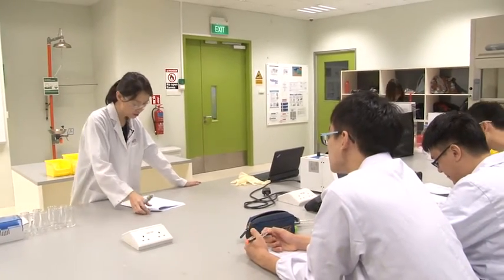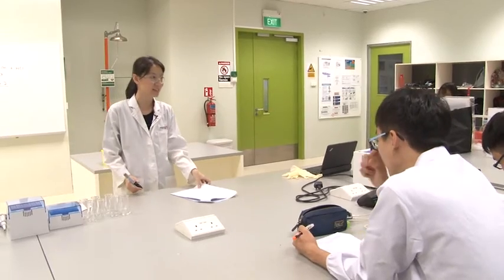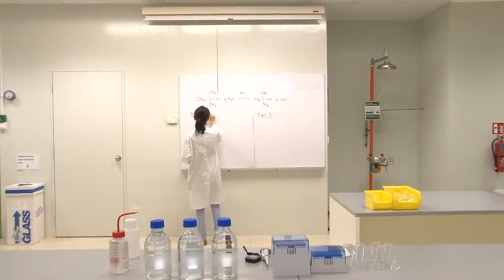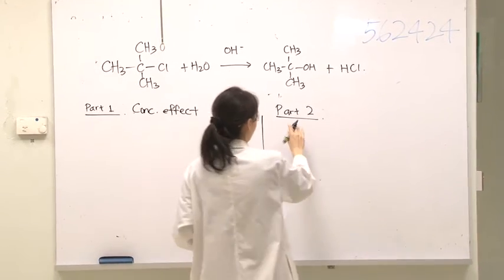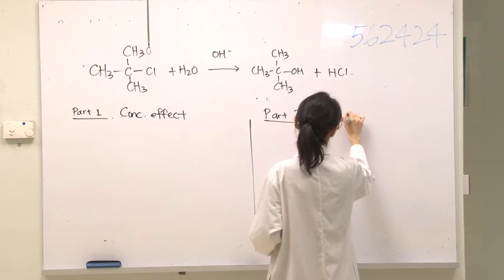So today we're going to investigate two things about how we perform SN1 kinetic studies. Part one is going to be concentration effect. So we're going to investigate the concentration effect of SN1 mechanism. Part 2 is on solvent effect.